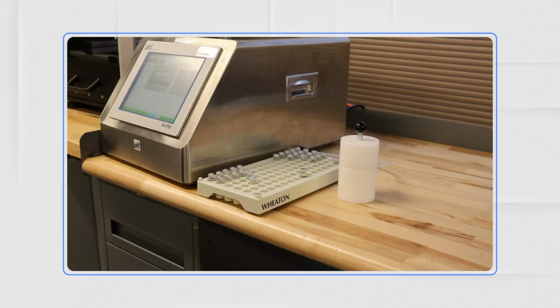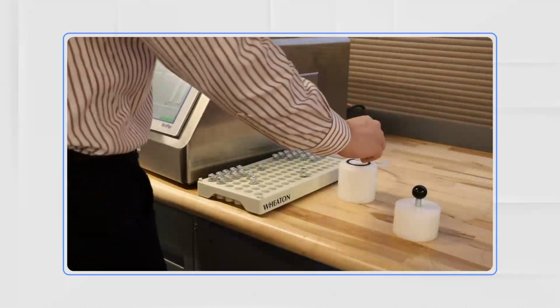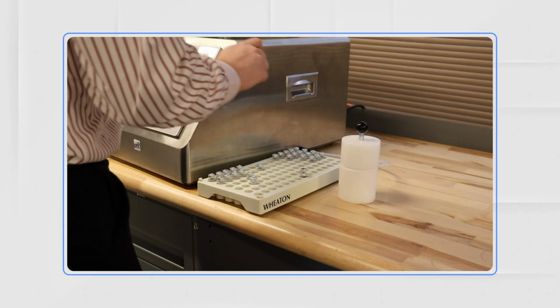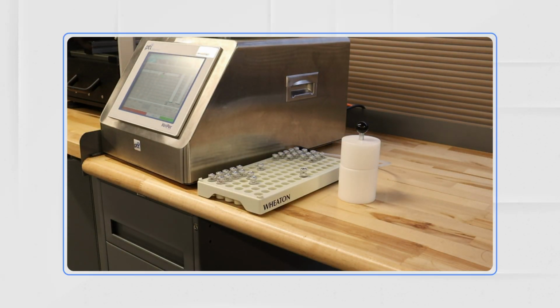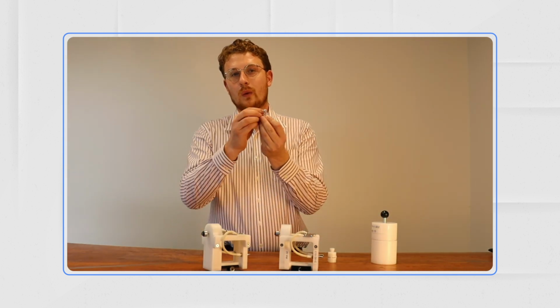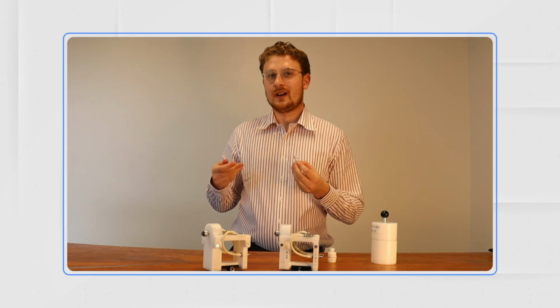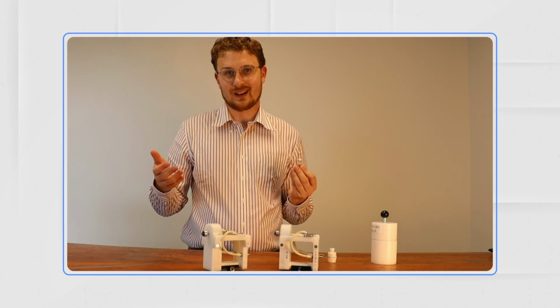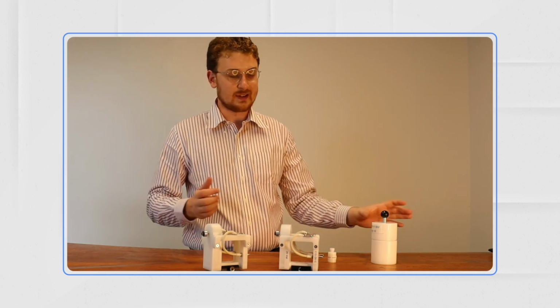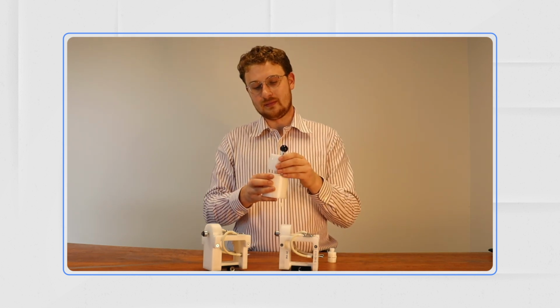However, this particular solvent is actually polymeric. This has an extremely low vaporization pressure, which means that we would have to get extremely close to absolute vacuum of 0 millibar, potentially even going into the ultra-torr range, to be able to actually vaporize this fluid once it egresses out of a defect site, to give us that increase in pressure that we're actually looking for during a vacuum decay test. So for those reasons, the original vacuum decay test wasn't very effective.